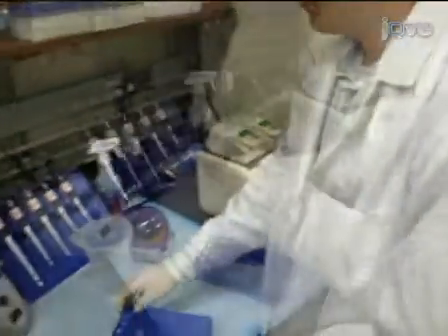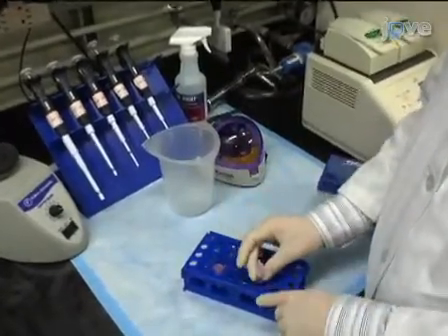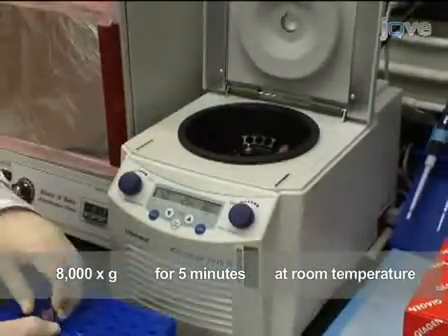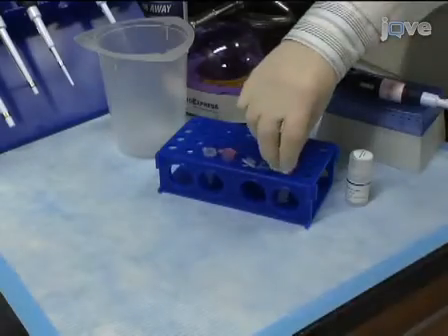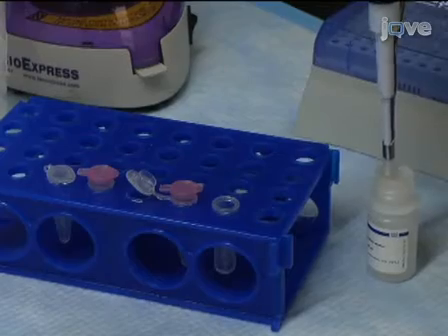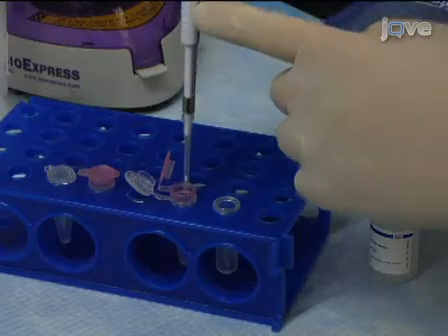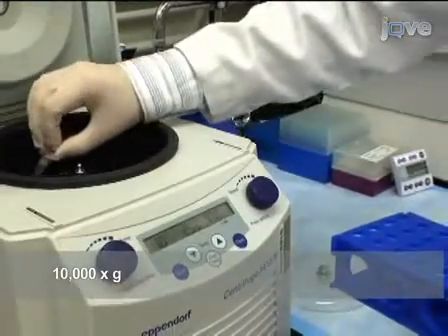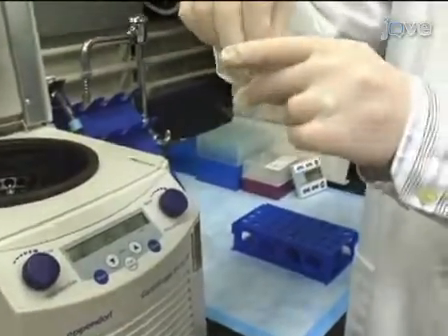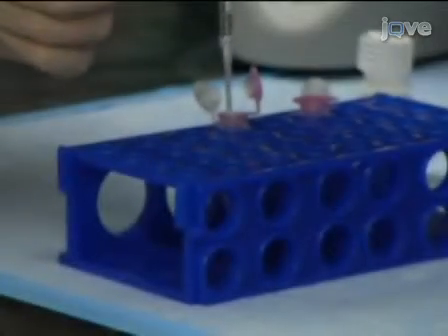After centrifugation, discard the flow-through and allow the column to dry for 5 minutes. Immediately centrifuge at 8,000 g for 5 minutes at room temperature to remove any leftover traces of ethanol. Transfer the spin column into a new 1.5 milliliter collection tube and add 10 microliters of nuclease-free water. Incubate for 1 minute. To elute the RNA, centrifuge at 10,000 g for 1 minute at room temperature. The RNA will be in the flow-through. Repeat the elution with another 10 microliters of water.